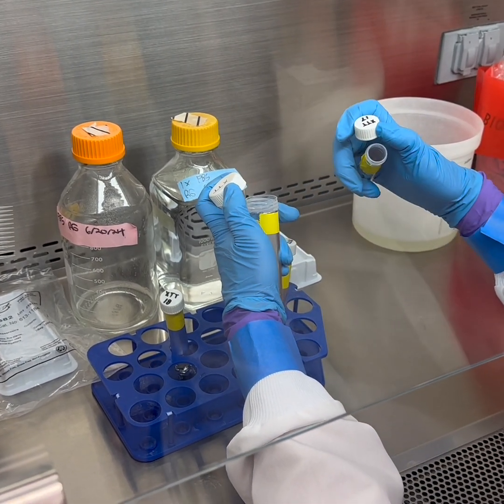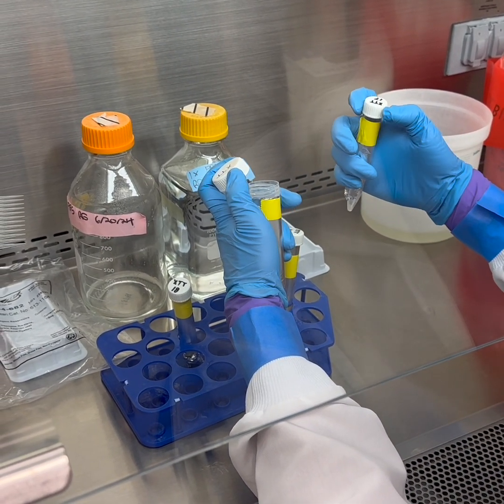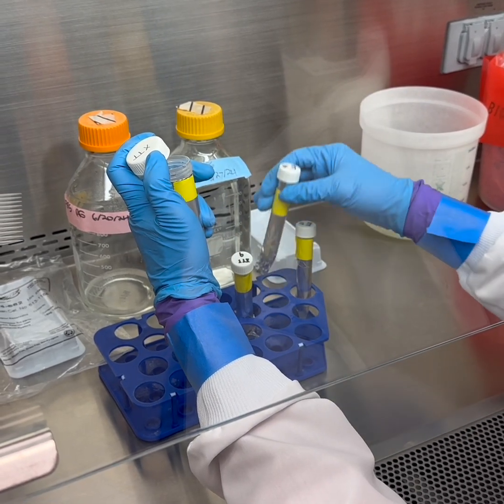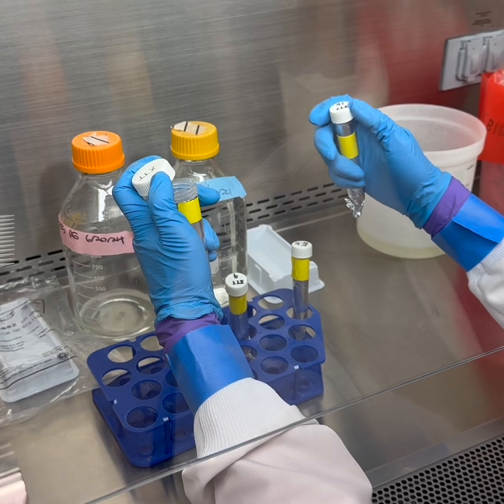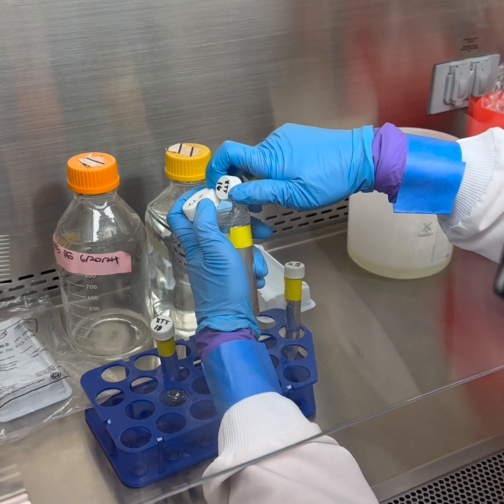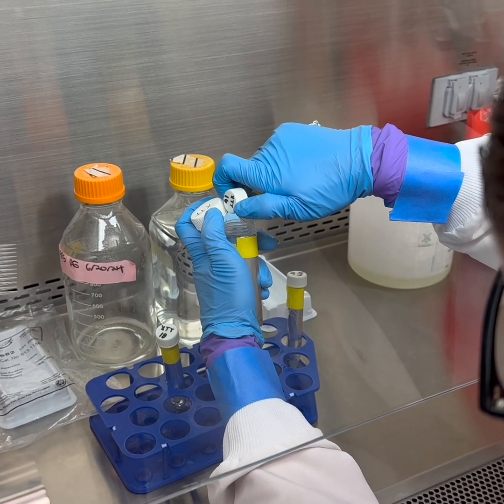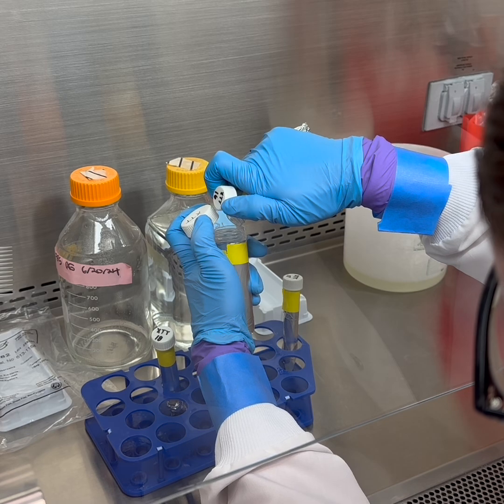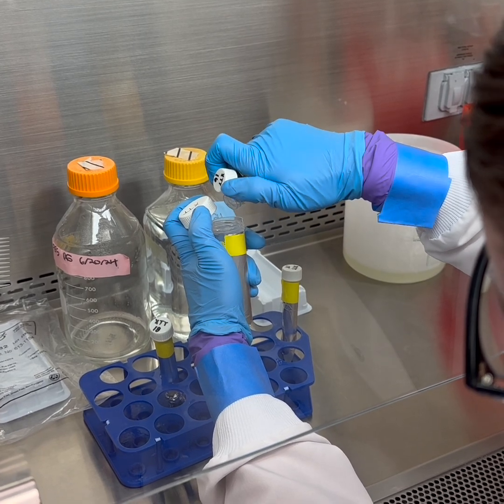Is that all of it? Okay, that's roughly all of it. And then add 1 microliter per plate of menadione, which is fungistatic and also extremely hazardous. So you want to be careful working with that.